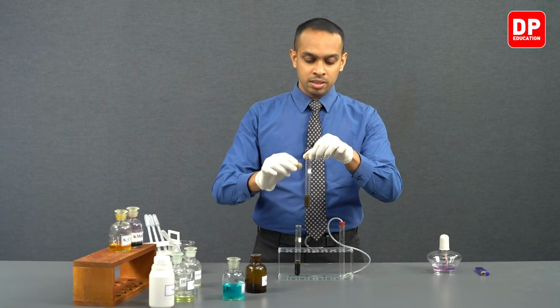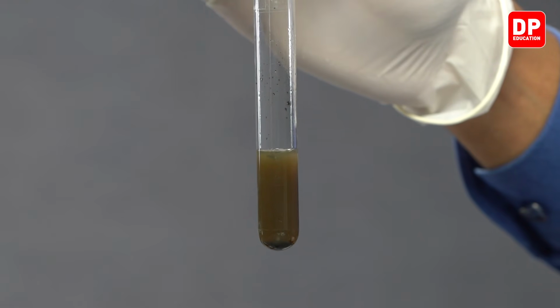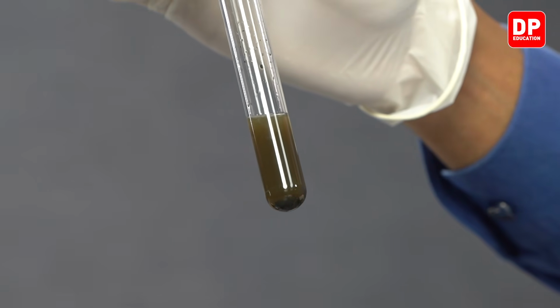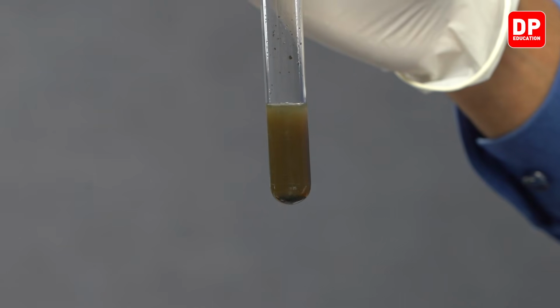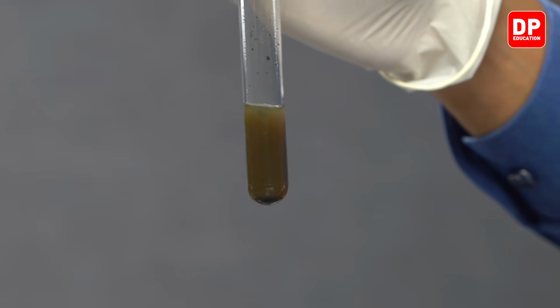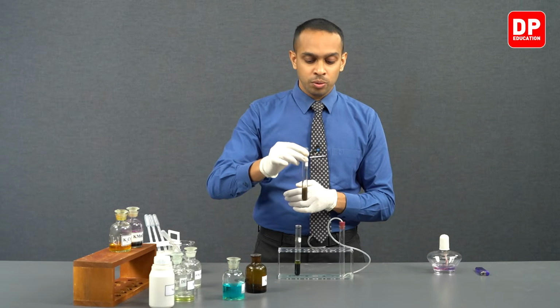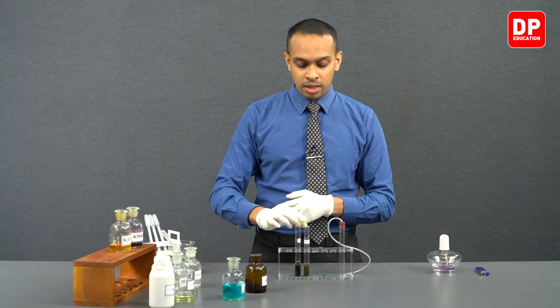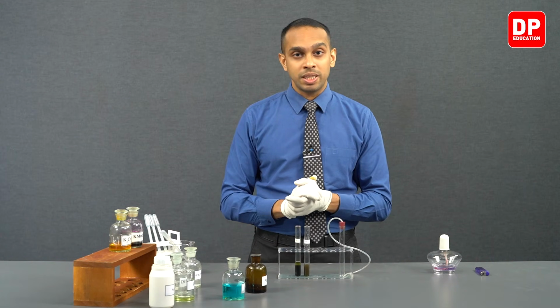And then in this test tube we have silver reacted with sulfide ions, and what you see over here is also the formation of black color silver sulfide precipitate, which is water insoluble and black in color. So you can use these two tests to identify the presence of sulfide ions in an aqueous medium.